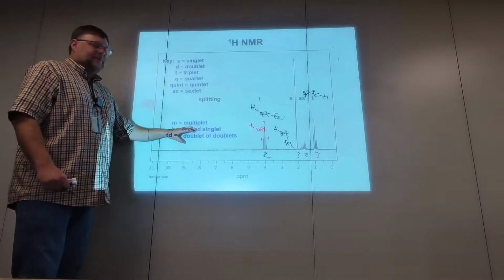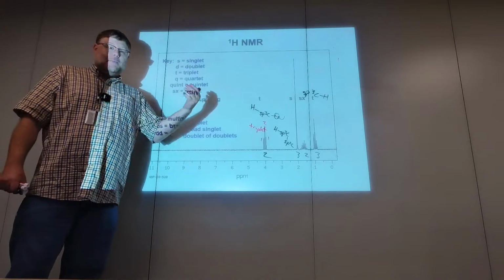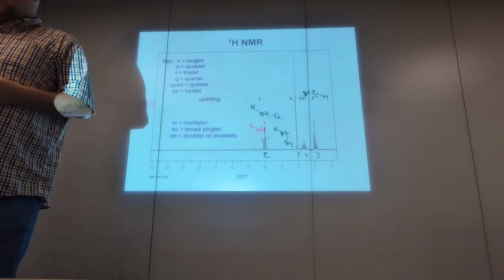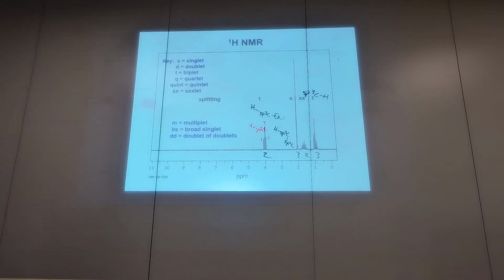All right, now with all this information, if you wanted to hit pause, maybe you can piece together the spectrum. Like I said, I could do that from here. If you don't feel up to it just yet, that's fine. Let's go to the next thing. I'll show you what the molecule is. So if you're going to give it a shot, hit pause.